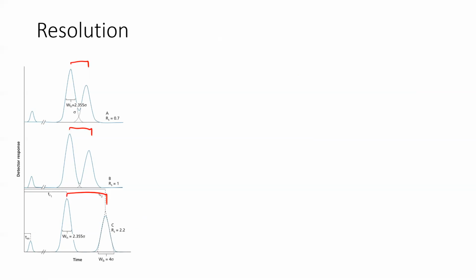It's a little bit different in chromatography than it is in mass spec or NMR or something like that, because instead of taking a particular peak and making it more narrow, that's what we do in UV vis, that's what we do in IR, we try to narrow things up so we can see what's around it.